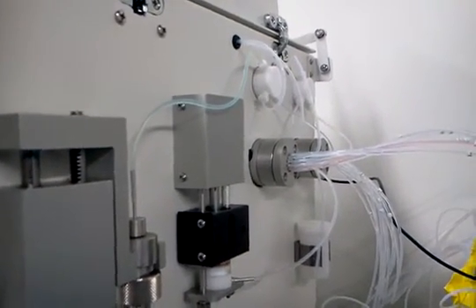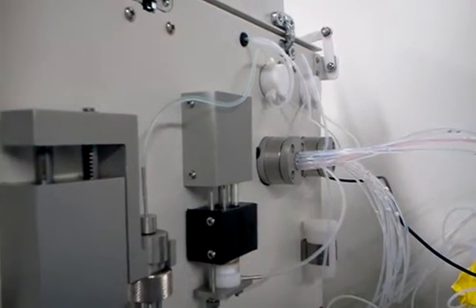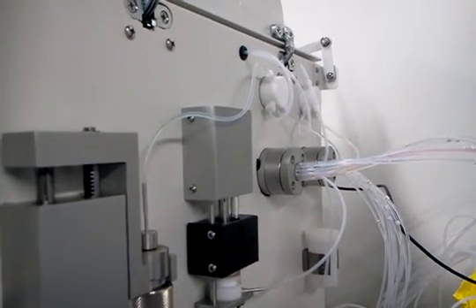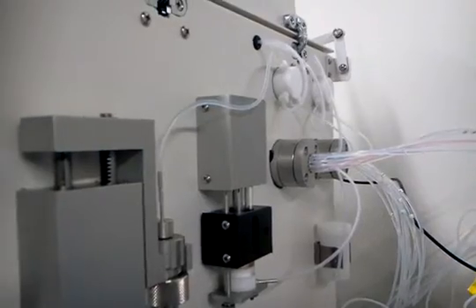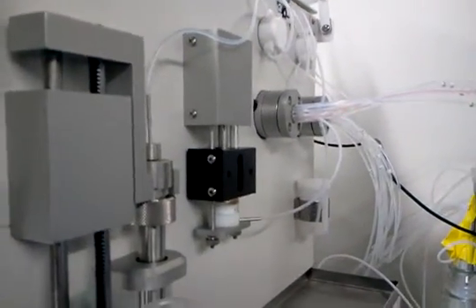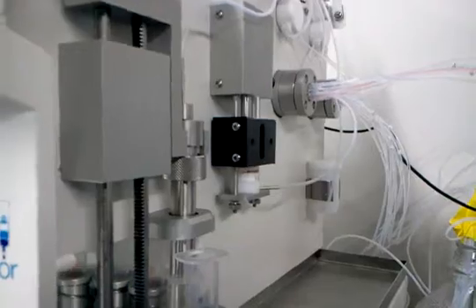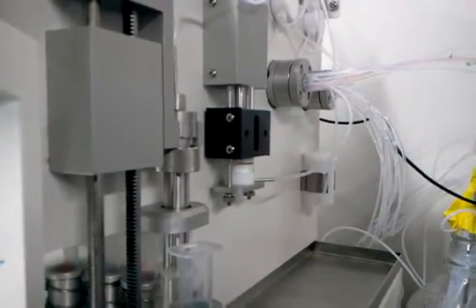The one mil is going to be pulled completely. The sample has been delivered to the head of the column, and in normal operations it will continue on with a wash and an elution.